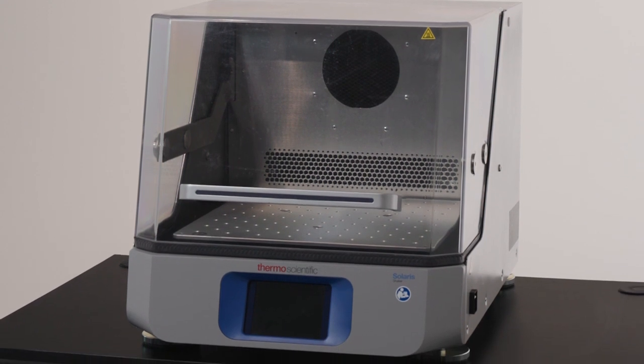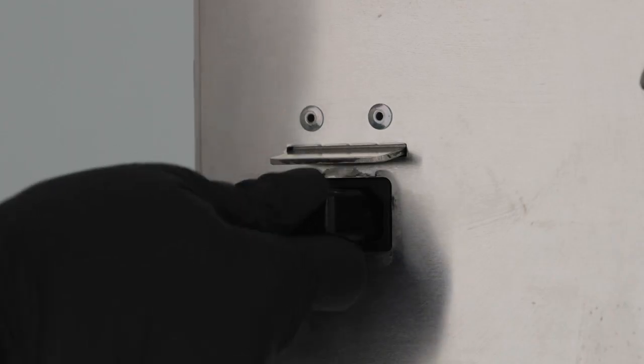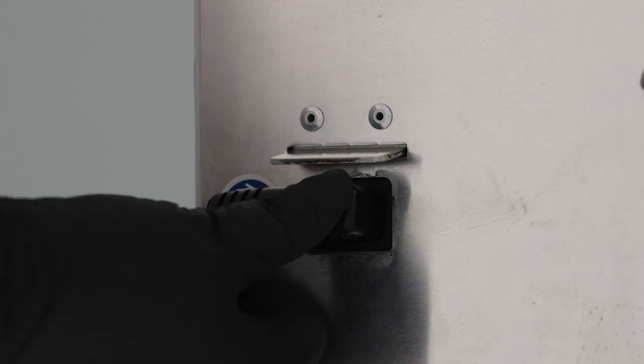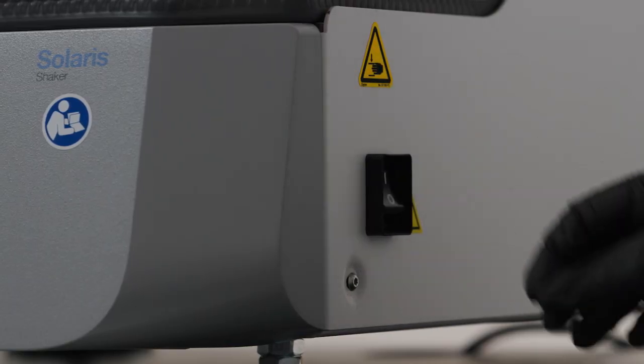When the shaker is in position and level, plug the power supply cable into an outlet and turn on the power supply switch along the right side.